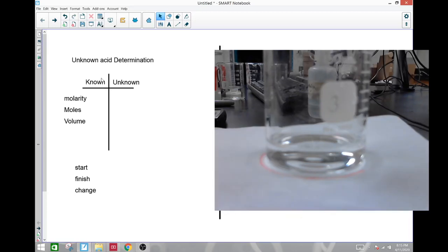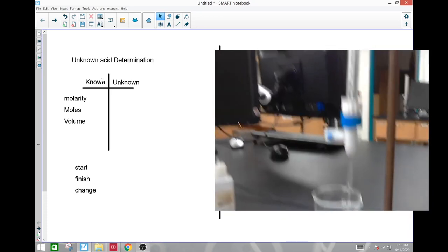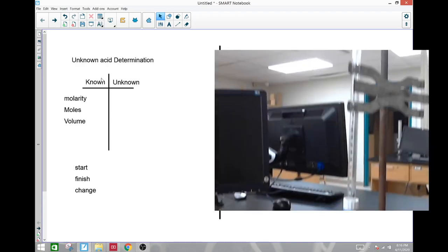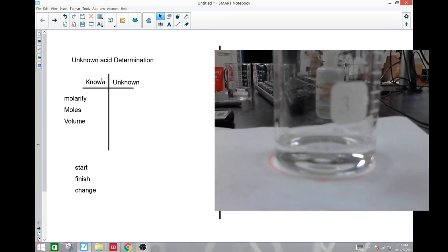We're going to run a practice, or I should say an unknown acid lab titration. So doing a titration, I have a beaker set up here, and I have a burette full of base. A few things you'd want to know before solving this problem is the known.